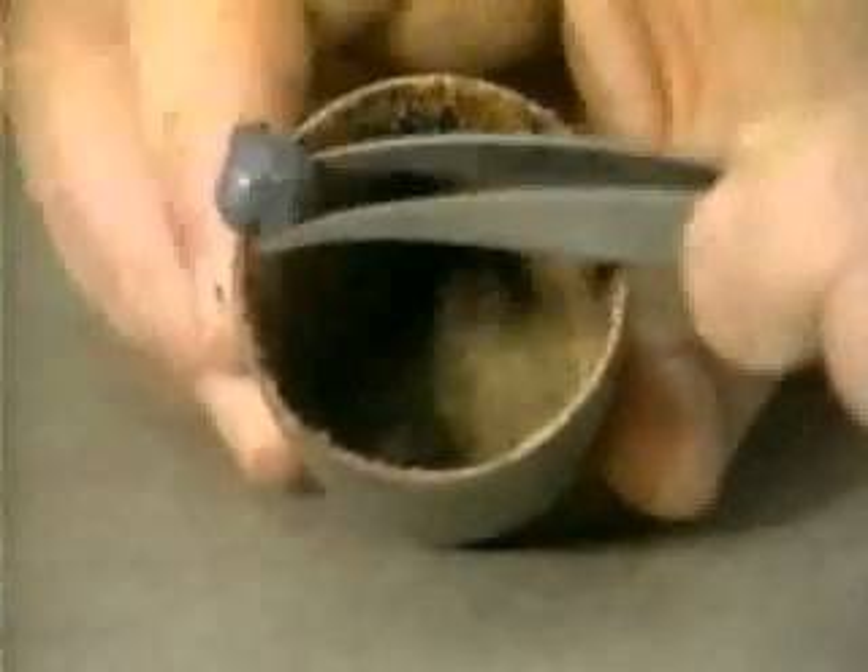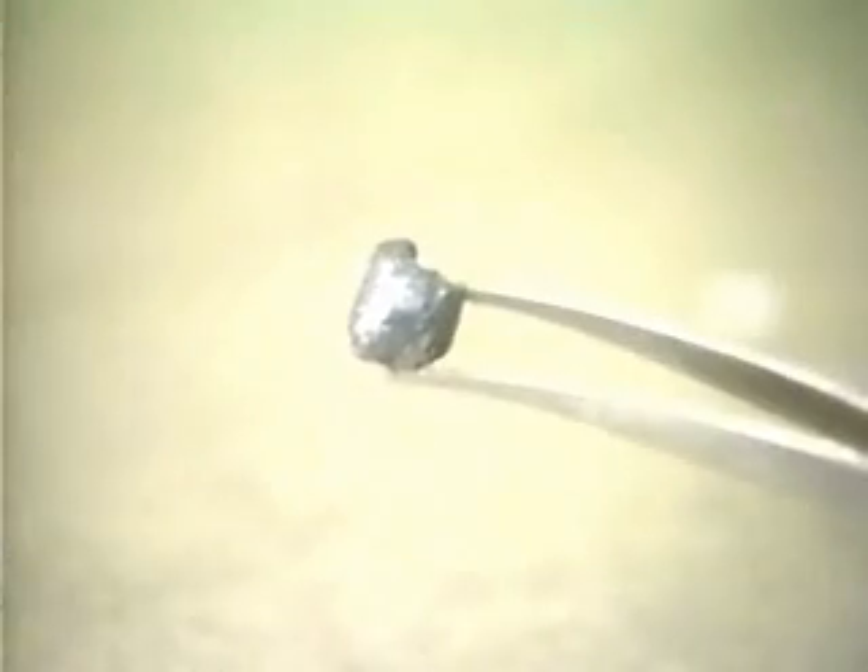When the crucible has cooled, we can remove the iron produced by the reduction of iron oxide and show that it is indeed iron by picking it up with a magnet.